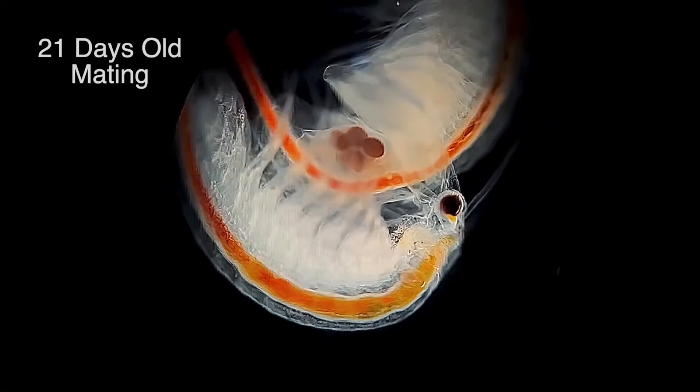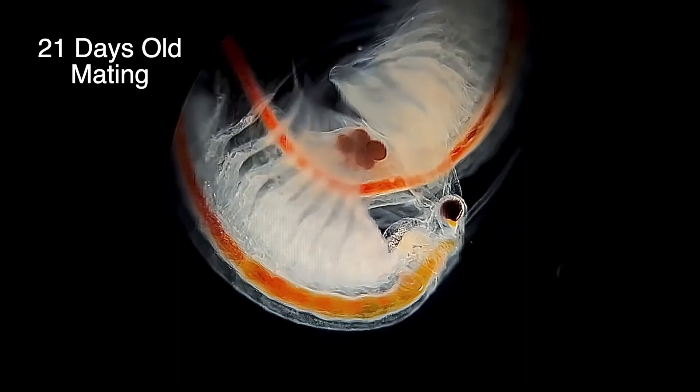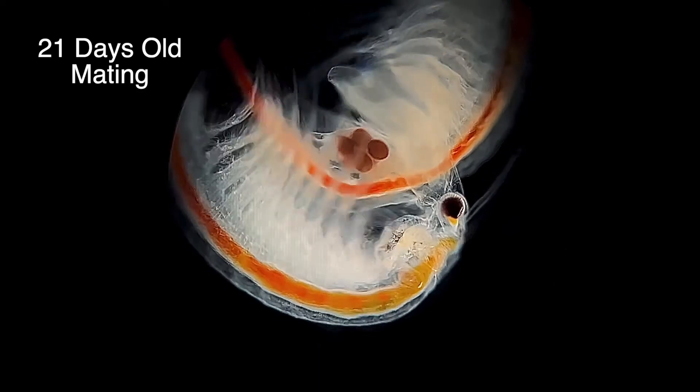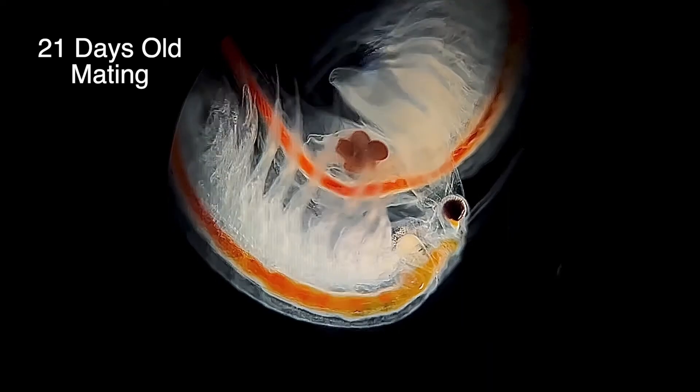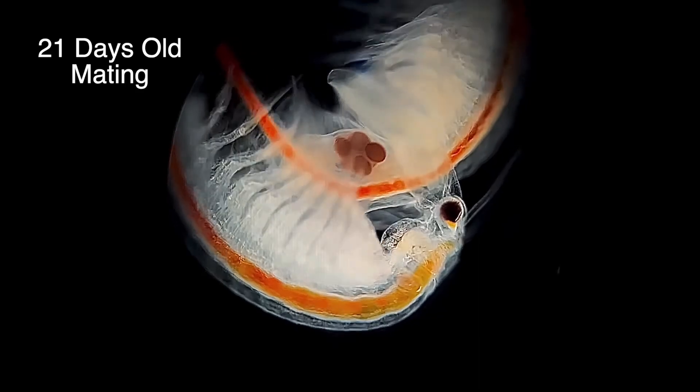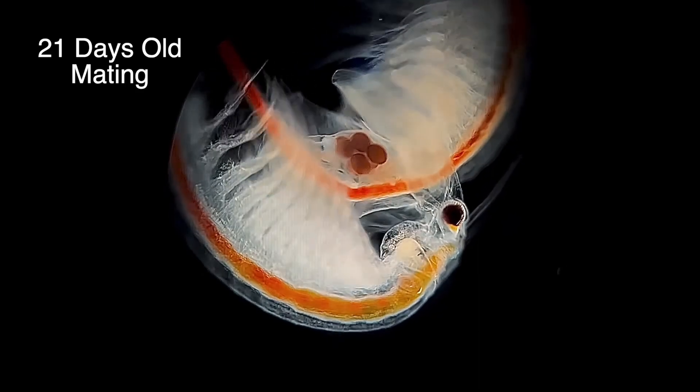And this is what mating looks like under the microscope. The reason why the male still isn't releasing the female, despite me removing them from the tank and putting them onto a microscope slide, is because mating isn't a fast interaction between sea monkeys. In fact it usually goes on for at least a few hours, but can often last as long as three days. Once he's got a good hold, he really doesn't want to let go.